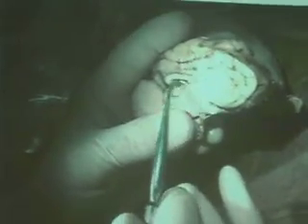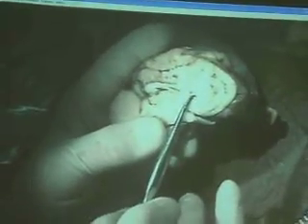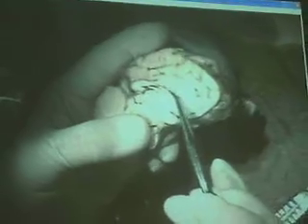In some of yours it'll be curly and brown; it's curly looking and white in this one that we just opened up. So again, corpus callosum up here, fornix down here, septum pellucidum, the little membrane separating the two lateral ventricles, and then this knot of capillaries on the inside.